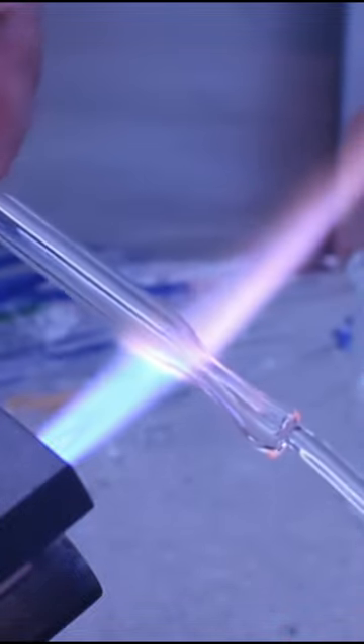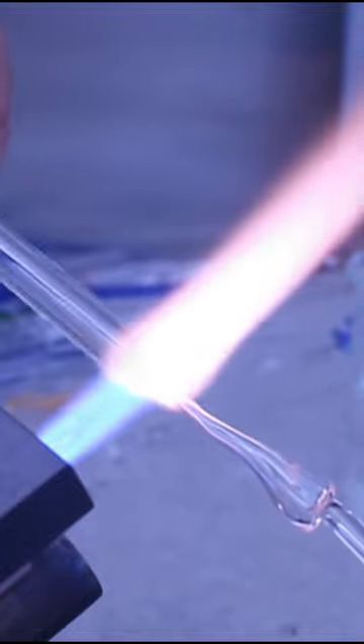Then go right into the flame, rotate, rotate, give it a little pull, and there you go.